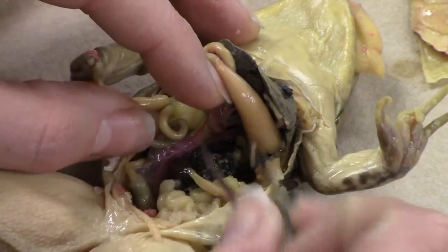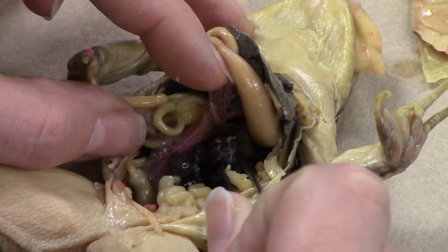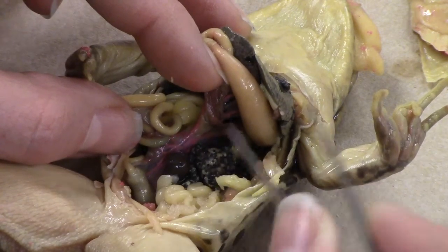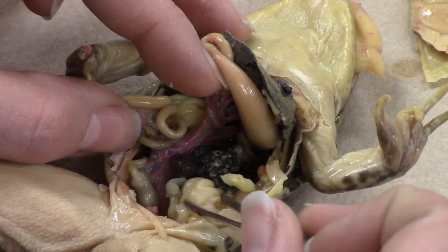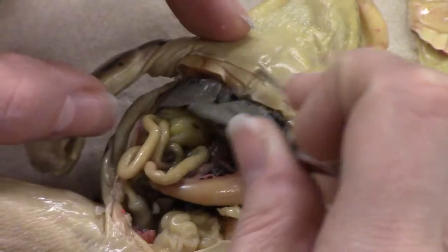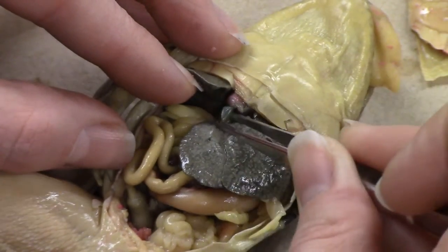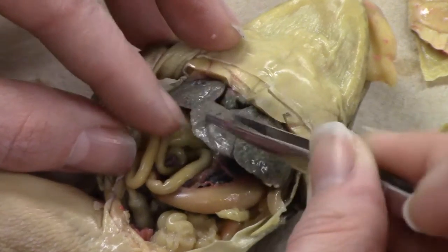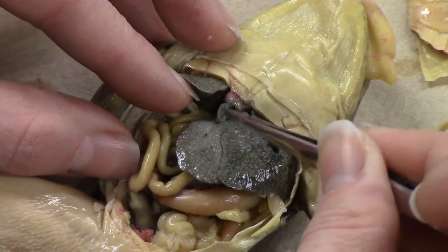Here's our first indication that this is actually a female frog — this black spongy stuff is actually the egg mass, so that's clue number one. Clue number two, right next to it, are the oviducts — and only female frogs have those. Another thing to be aware of is the gallbladder — it is this small P-shaped organ right here. Sometimes it's tucked underneath the liver, but mine is sticking out nicely.